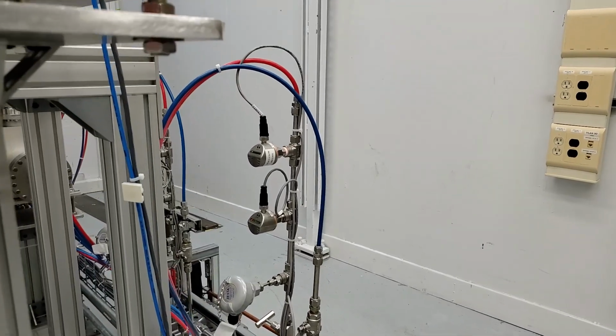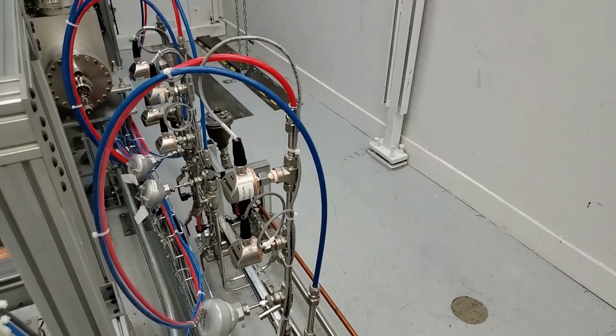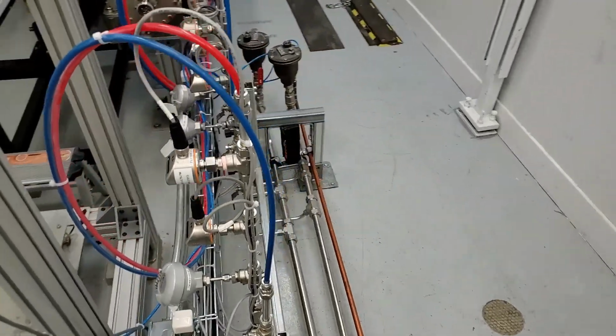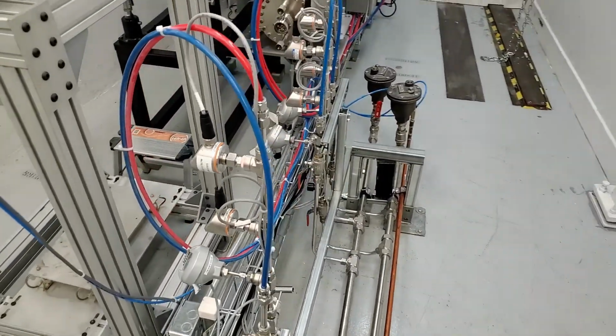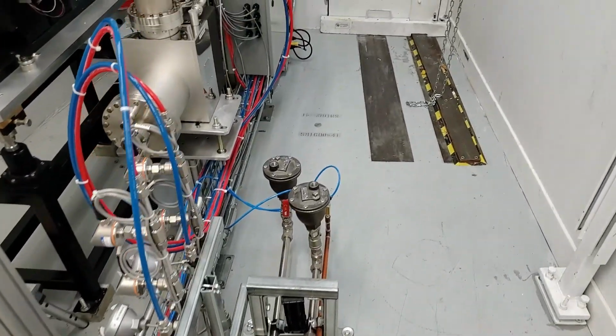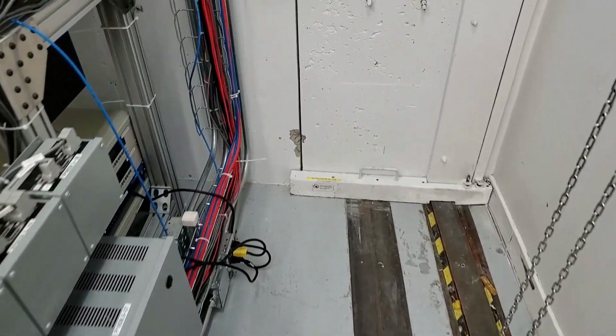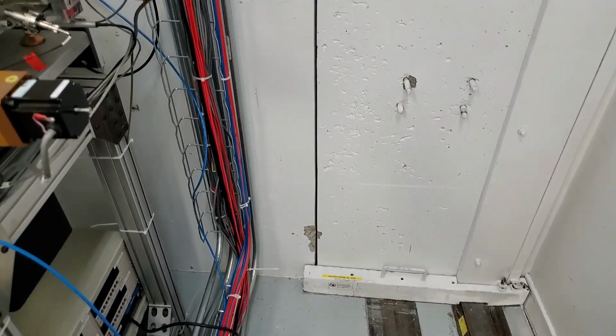These red and blue tubes provide cooling water to some of the optical components in the beamline that are exposed directly to the synchrotron light. There is a large amount of power in the beam, and since the optics are mounted in vacuum, there is no convection and very little conduction to remove heat from the system. Without water cooling, the light from the synchrotron would destroy these components.